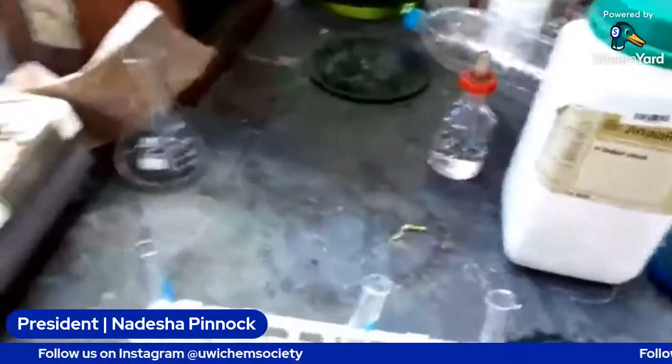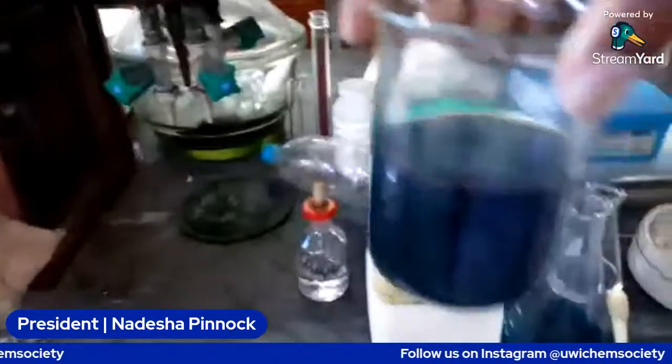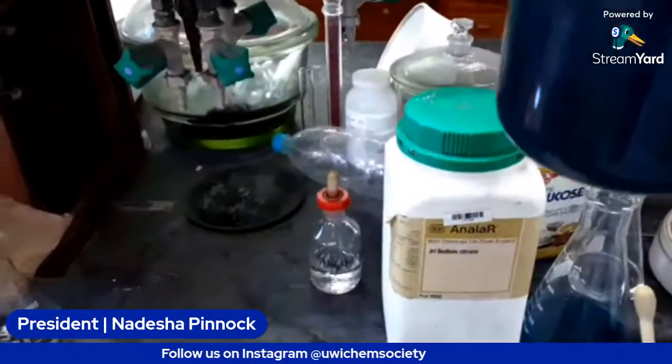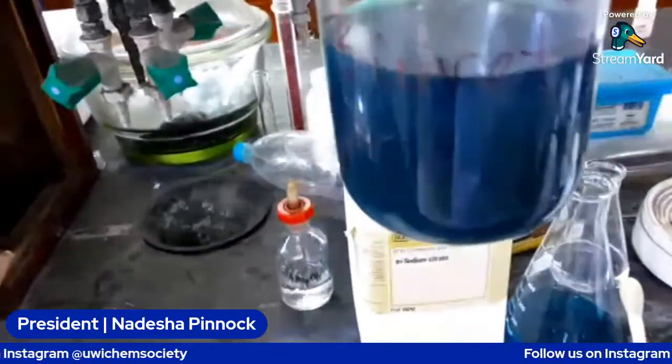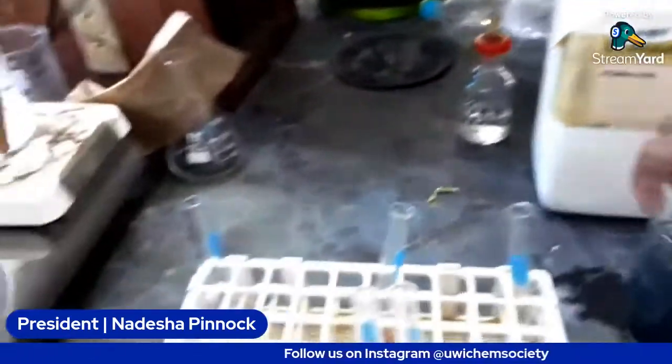However, we did not use any sodium potassium tartrate. We're going to go ahead and use the copper sulfate along with sodium hydroxide, so we're just going to use this for the test.